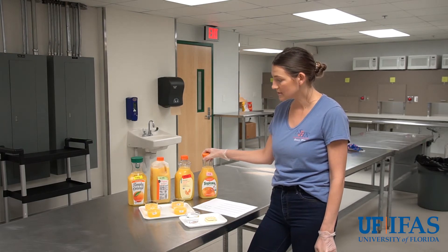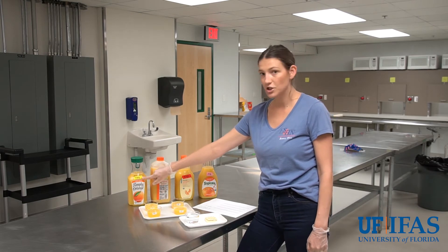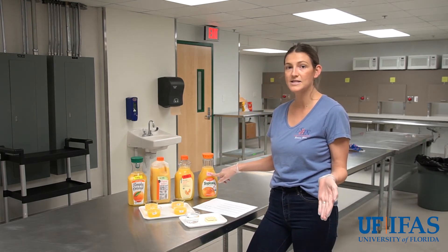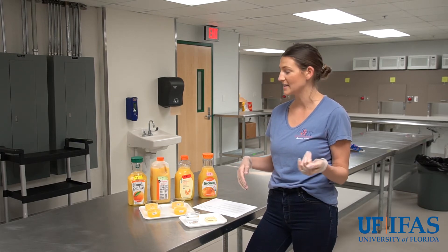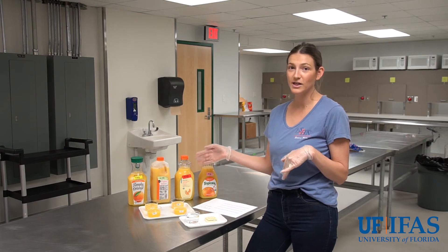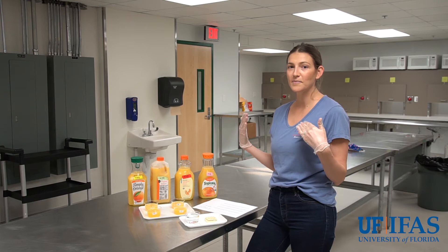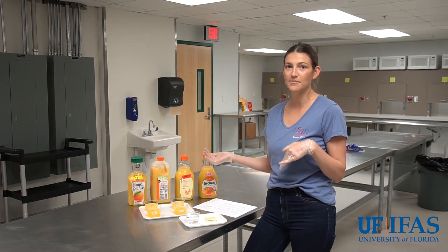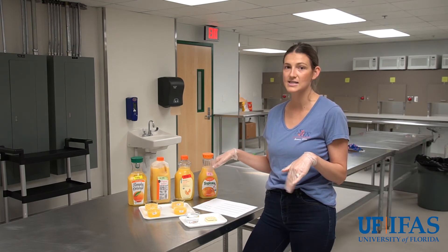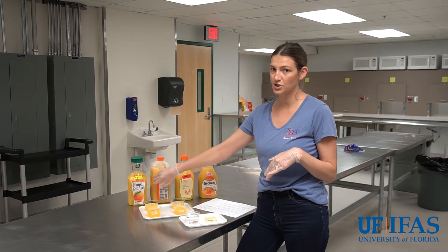In order to run a sensory test, the first thing we want to do is make sure that the samples are blinded. You can see we have a three-digit code for each sample, and that helps prevent any bias. For example, if I gave you a tray and said this is Simply Orange, this is Publix, this is Greenwise organic, and this is Tropicana, you might already have in your mind that you think you're going to like Simply better. We want it to be a completely blinded test so you're not influenced by the brands — that's why we use these three-digit randomized codes.